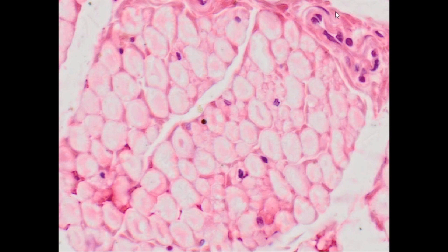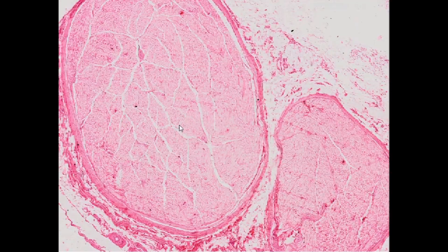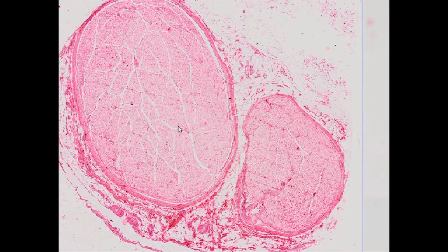Nerve fibers form bundles or bunches; there may be up to several hundred nerve fibers in one bundle. Each bundle is surrounded by a layer consisting mainly of fibroblasts, called the perineurium.